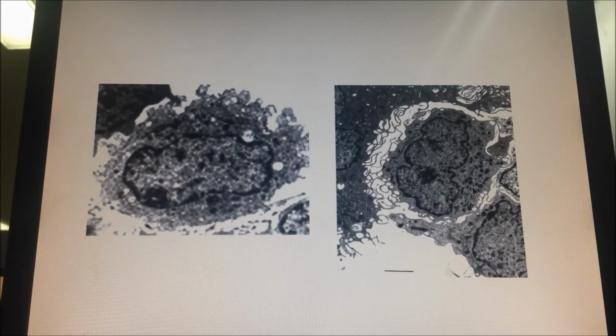The macrophage من ايش مشتقة؟ It's derived from what? من monocyte, من blood monocyte. نفس الشيء هنا يمكن لسه clear شوي السكشن قواليتي فيه بس irregular nucleus وحتى السيتوبلازم نفسه irregular. النيوكليوس is eccentric مش بالطرف والبلاك granules are lysosomes for the macrophage.